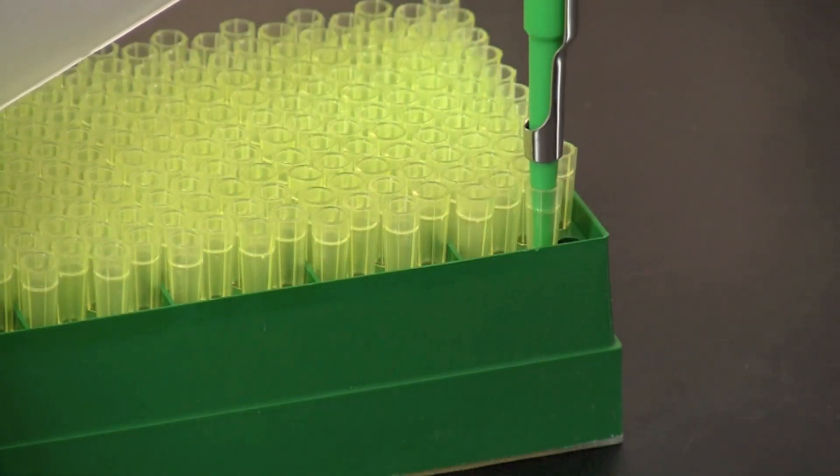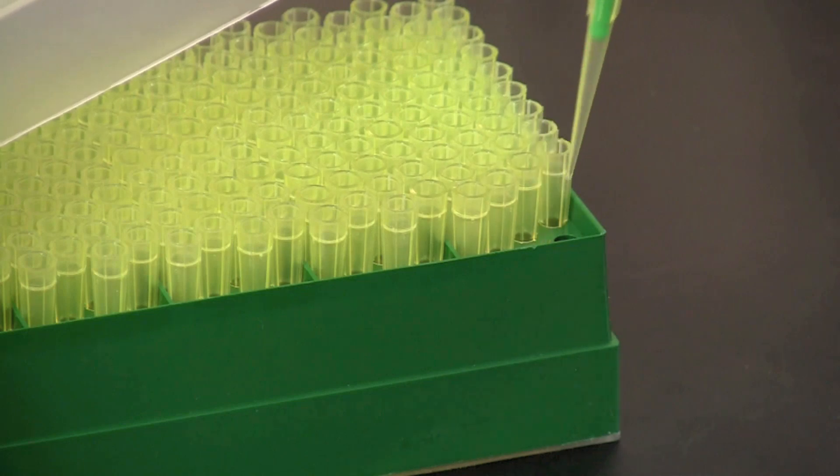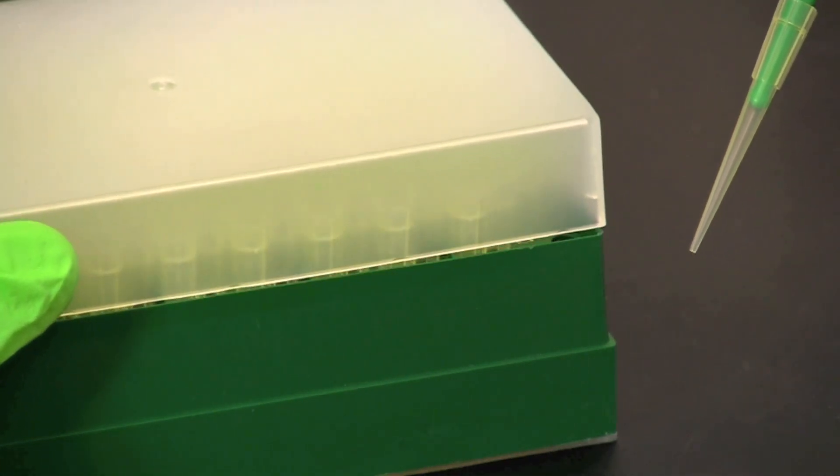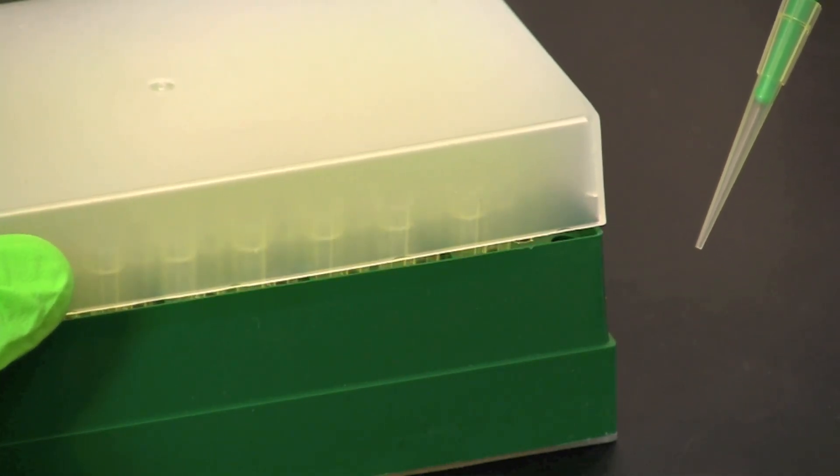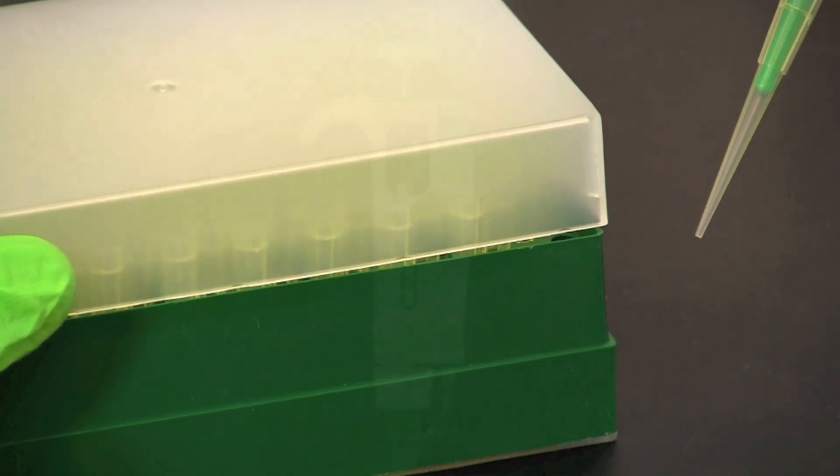After the correct volume has been set place a disposable tip onto the pipette. It is important to apply gentle but firm pressure so that a good airtight seal is made between the pipette and the tip.